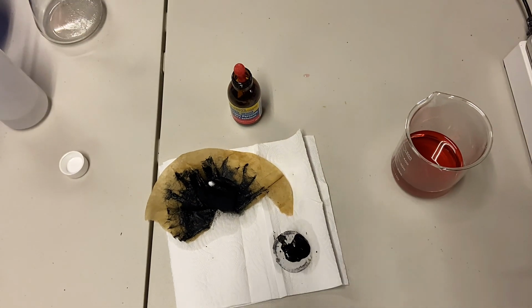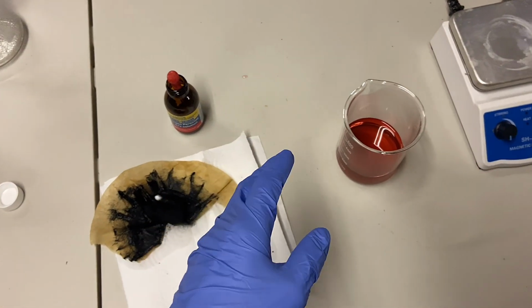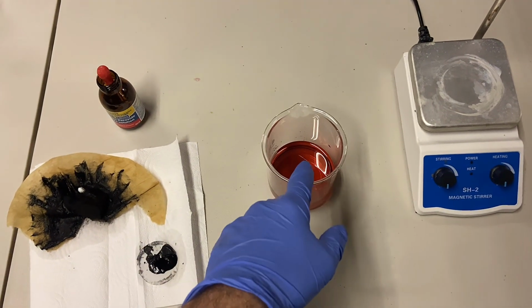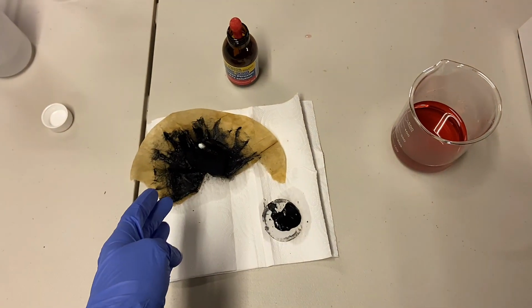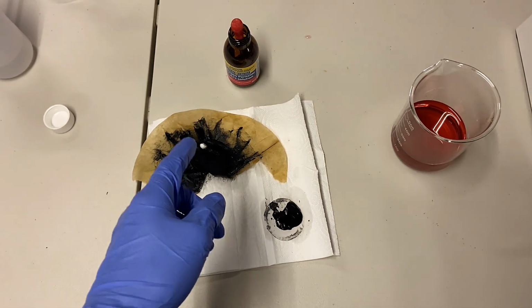And that is the proof that this is in fact manganese dioxide that I've extracted from a vape battery. So that's going to do it for this video. In future videos, I'm going to keep messing with this and getting more stuff out of it. But all in all, a successful extraction of manganese dioxide from a vape battery.